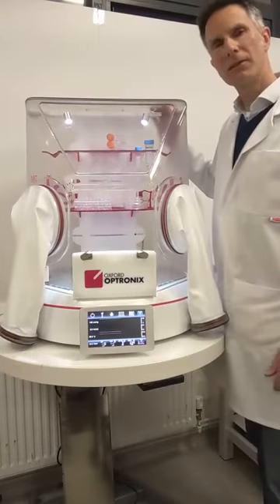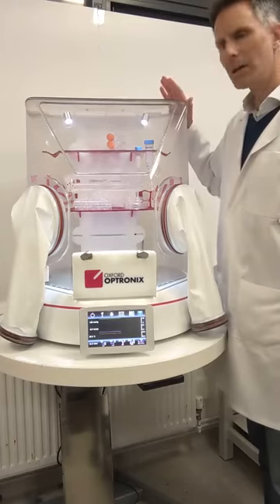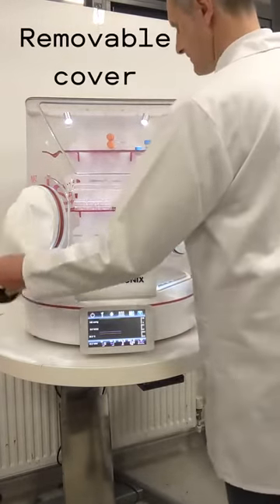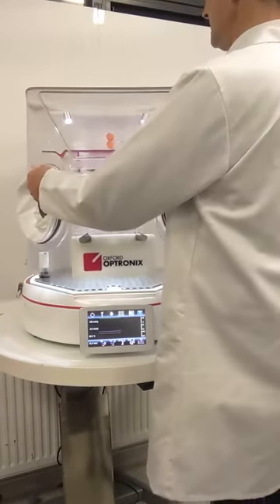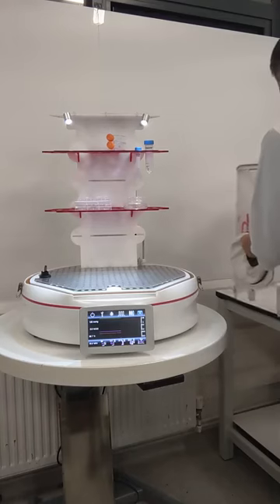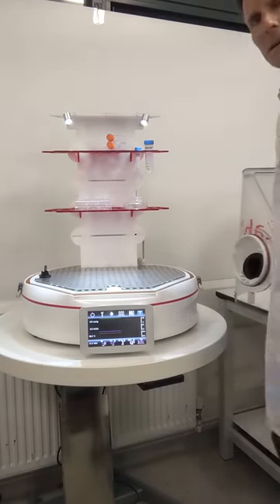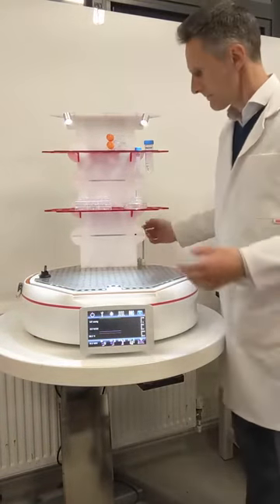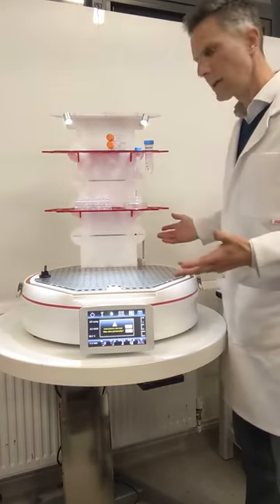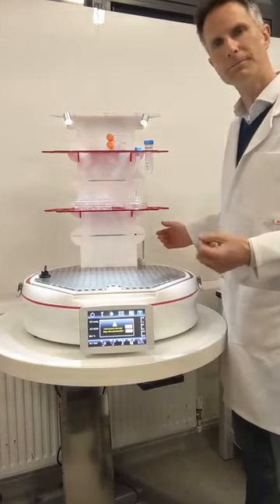Among other benefits of the HypoxyLab is a very easily removable cover. This allows ease of access to all internal surfaces for cleaning and for disinfection.